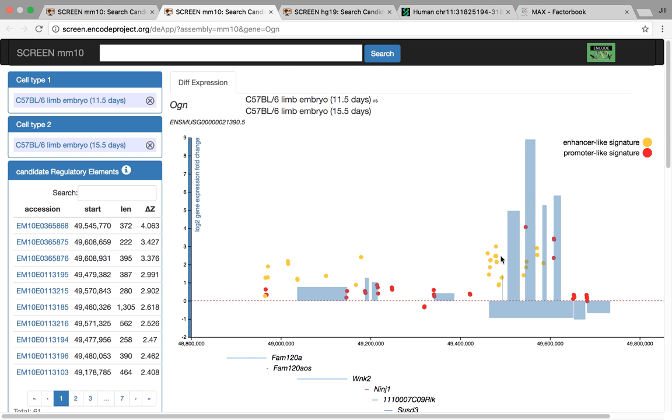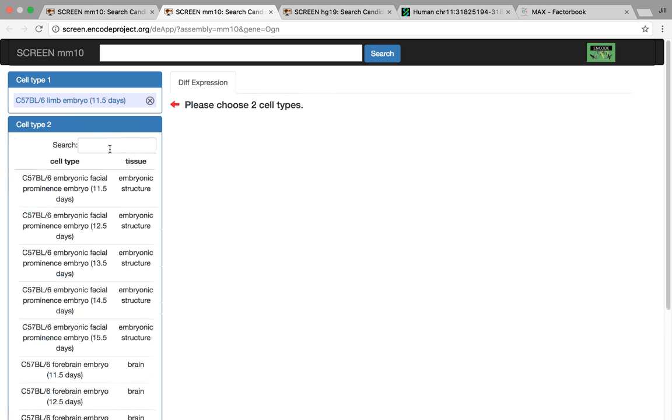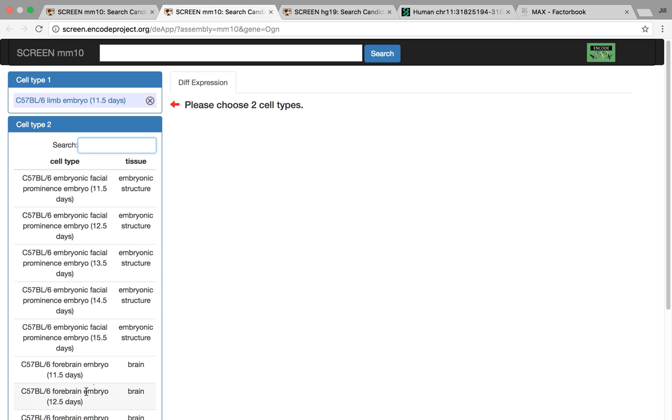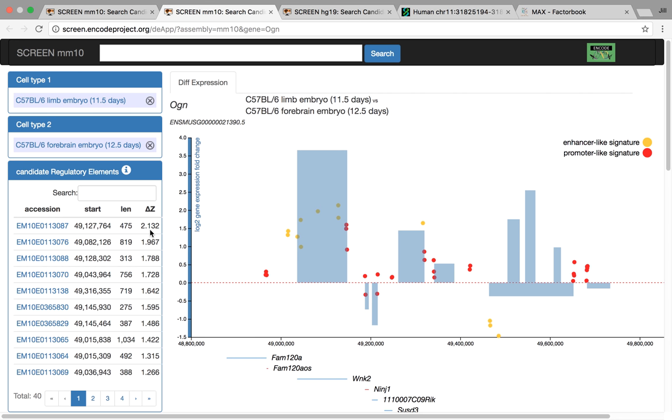Here you have two different comparison cell lines, one versus the other. And you can deselect these and look around and find whatever in particular you'd like to explore.